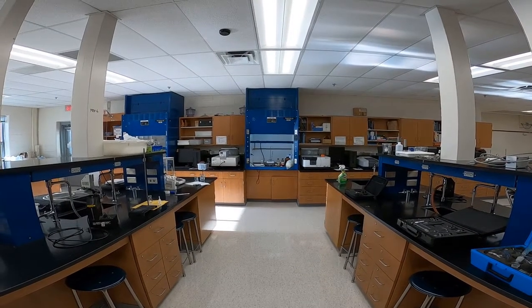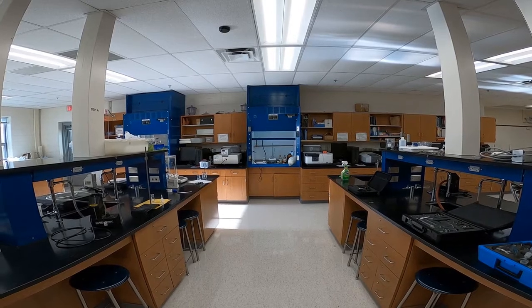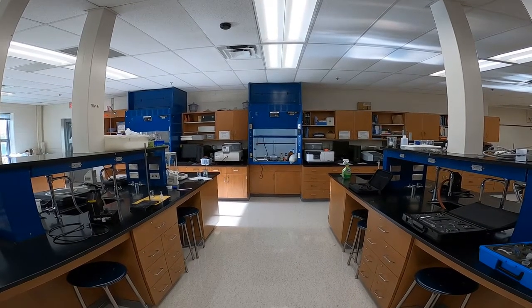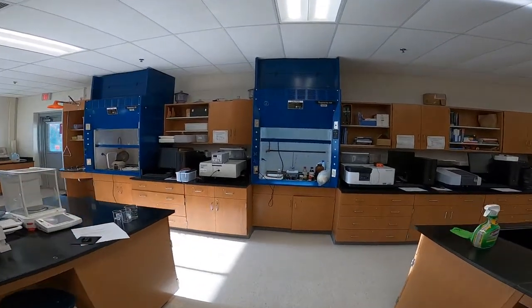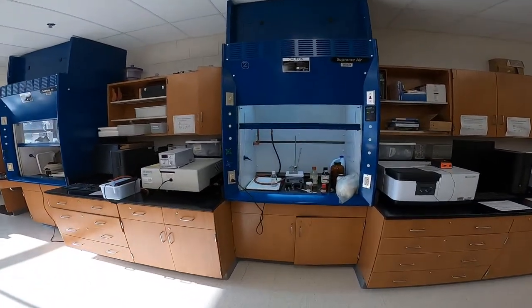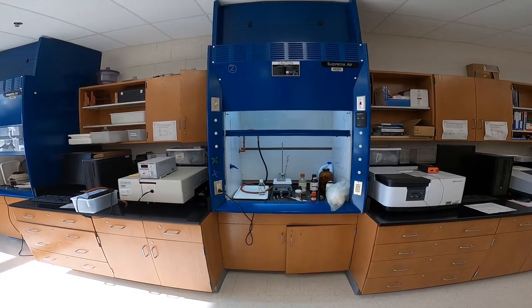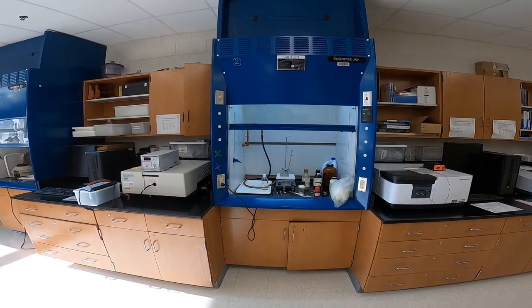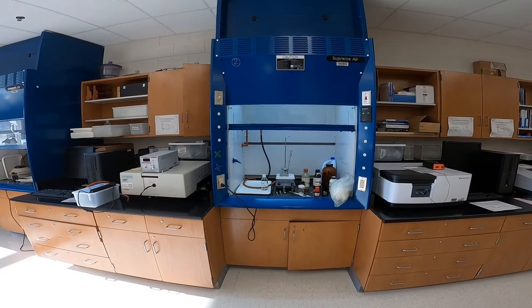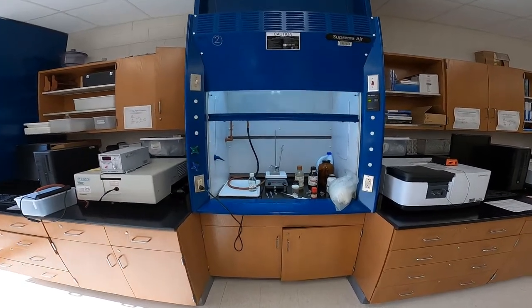Hello, organic chemistry. In this lab, we will be preparing a simple ester, isopentyl acetate. Due to the type of chemicals we'll be working with, the entire setup and operation of the experiment will be performed in the fume hood.